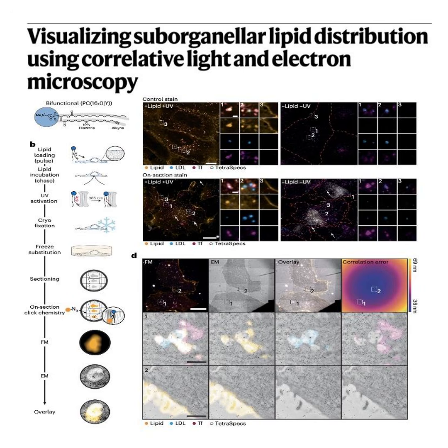Number 1, researchers mapped the post office of the early endosome using LDL to mark the destruction route and transferrin to mark the recycling route. Yep. Number 2, using 3D density calculations, they proved sphingomyelin is heavily concentrated into the destruction route and mathematically kept out of the recycling tubules. And number 3, comparing this to palmitic acid proves the cell actively sorts its structural fats based on their exact chemical identity. A perfect distillation.